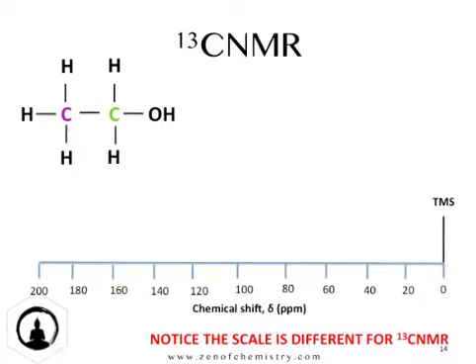So if you go and have a look at your carbon NMR table in your data book, a CH3 can be in, I think it's like 18 to 40. I can't remember the numbers exactly, but 20 will do for today. And then a carbon that's right next to an alcohol group here, I'm going to pop it at 60 ppm.